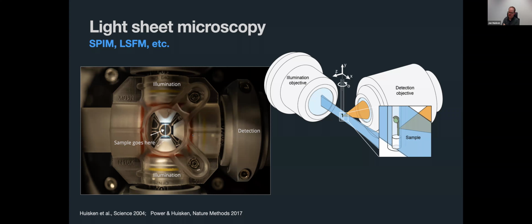So we force people to think about this first, and purchase a data storage solution before they can actually run their first experiment. I think there has to be a conversation before the imaging, so that people are aware of their data storage needs and think ahead a little bit about how they need to process the data.